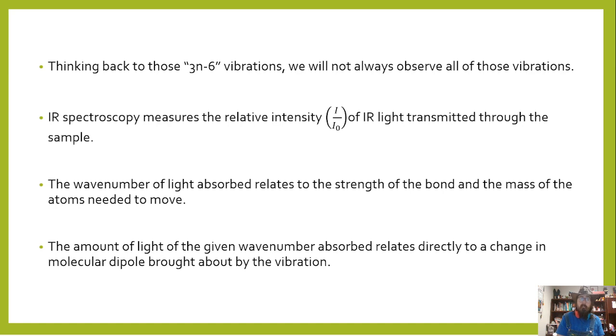The wave number of the light absorbed relates to the strength of the bonds and the masses, but the amount of light absorbed relates essentially to a change in molecular dipole brought about by this vibration. So you've got to think about, would this stretch change the molecular dipole? The more it's changing the molecular dipole, the greater the degree of absorption.